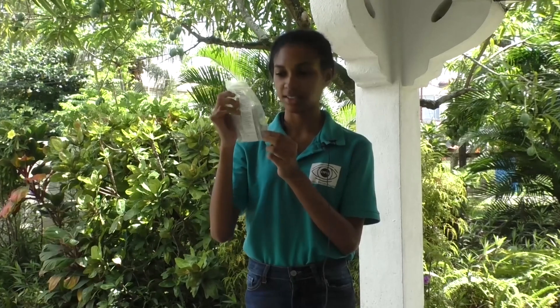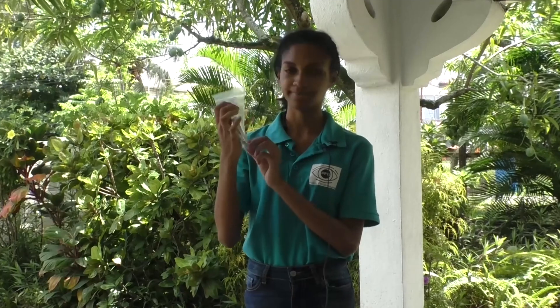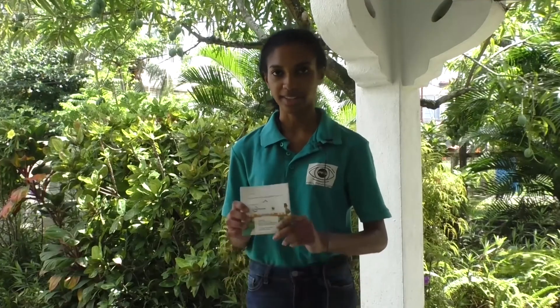The coliform bacteria tablets won't be found in this packet. The only tablets found in this packet are for nitrate, phosphate, dissolved oxygen, pH, and biochemical oxygen demand. You also have your chart to compare your results and the water monitoring manual.